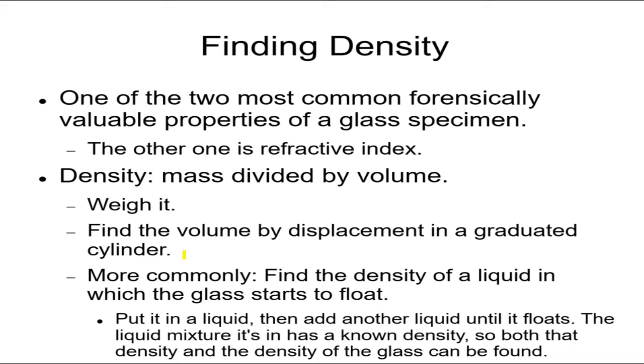We need more evidence, but this is certainly a starting point. That's the simple way to get the density. However, more commonly, it's done faster in this way. What we do is we find the density of a liquid in which the glass starts to float.